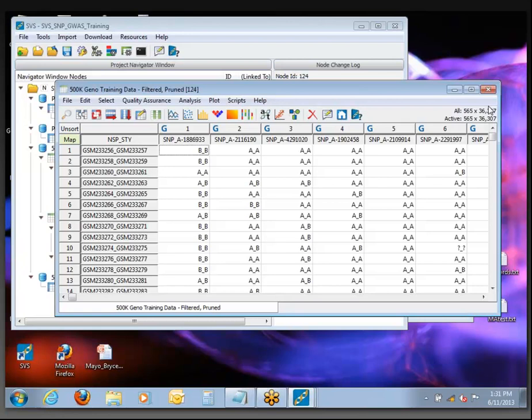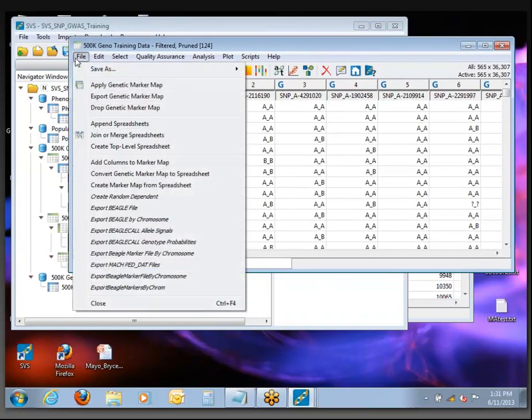The way we're going to do this is a little different from the data merges we've already done. In this pruned spreadsheet under the File menu, in addition to Join or Merge Spreadsheets there's also one right above it called Append Spreadsheets. If we're joining data where we're adding additional rows for the same set of columns, the Append option is usually the way to go. Think of Append as concatenating additional fields onto the bottom of the spreadsheet.